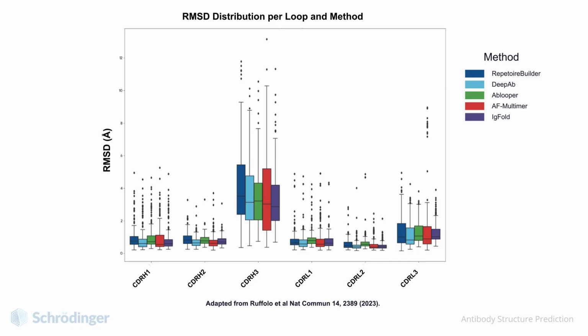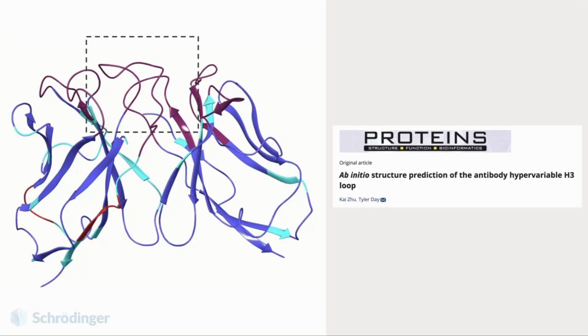There is reason to believe that advances in antibody structure prediction algorithms will likely lead to an improvement in H3 loop prediction, but it is certainly not solved currently and is a very difficult task given the diversity of the data. To address this fundamental problem of H3 loop diversity, Schrödinger developed a de novo loop prediction algorithm that, quote, samples the loop conformational space iteratively with varying focus and strategy, using the energy function as a guide to locate and identify low-energy loop candidates.